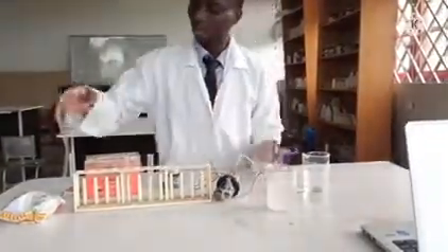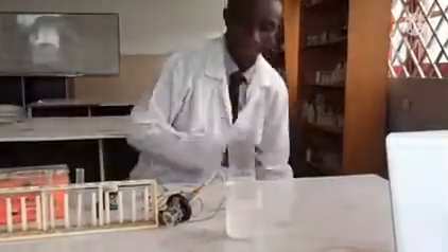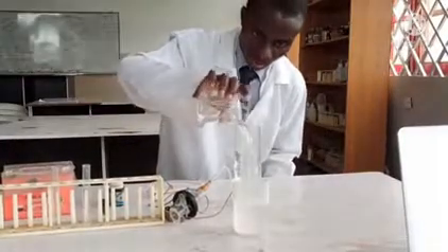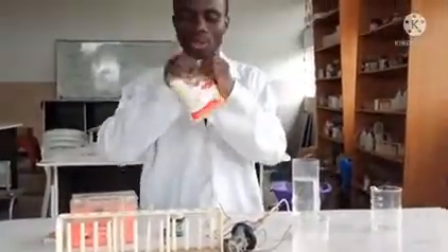First of all, I will be pouring some amount of water here and fill it up. Then I will be adding salt to it. This is the normal cooking salt — sodium chloride.